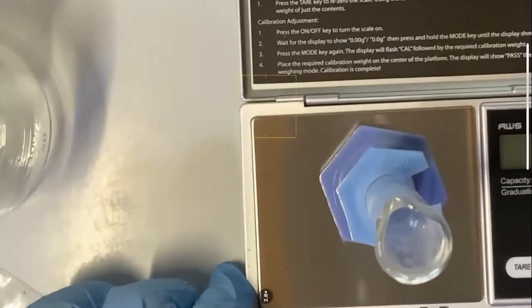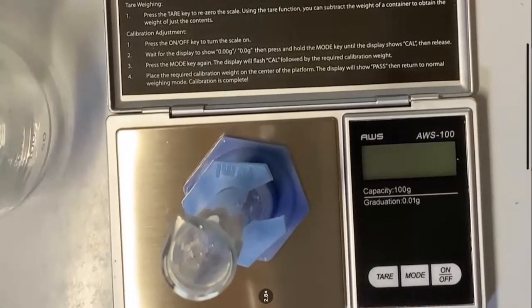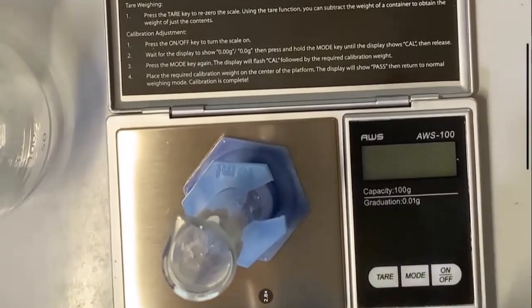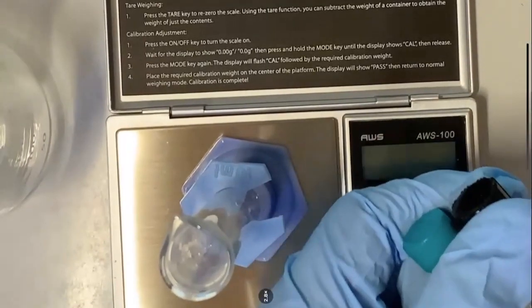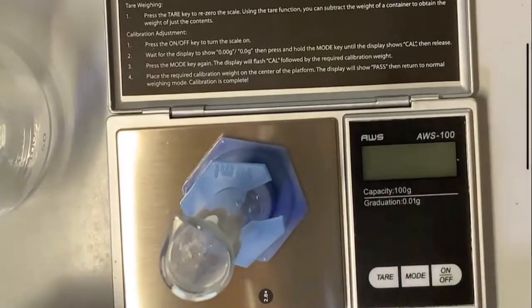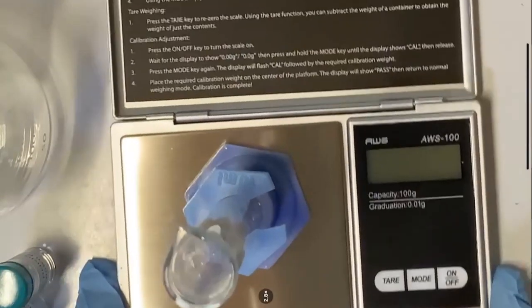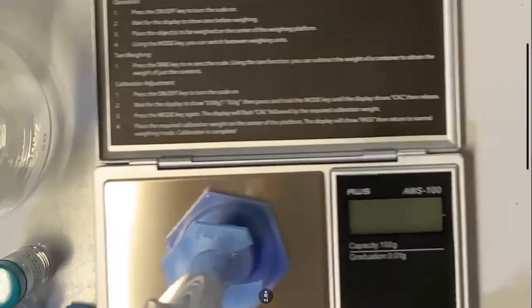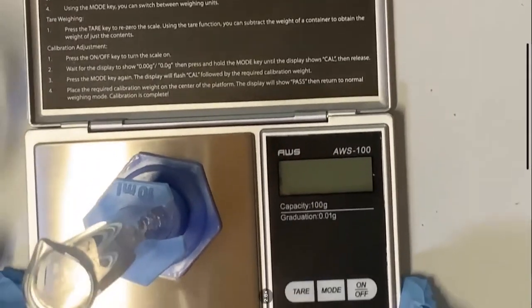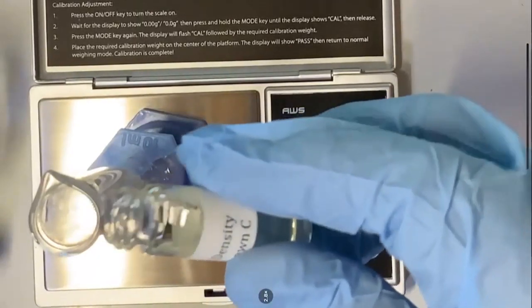And in this particular case, this is what I will do. I will take the third liquid. Make sure that you close the container for your other two. Okay, make sure you close that so that there's no residual liquid spilling over on your workspace. So I'm just going to do the third one right here. Okay, I'm trying to center this on my desk. So the third one, liquid C, I'm just going to pour it.